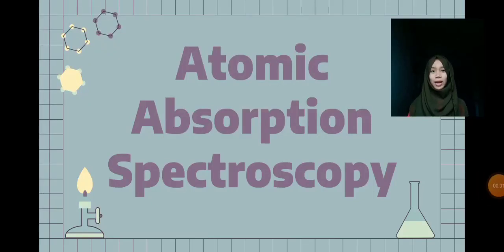Good day everyone, I am Farima Pinaw and for today, I'm going to discuss Atomic Absorption Spectroscopy or AAS.